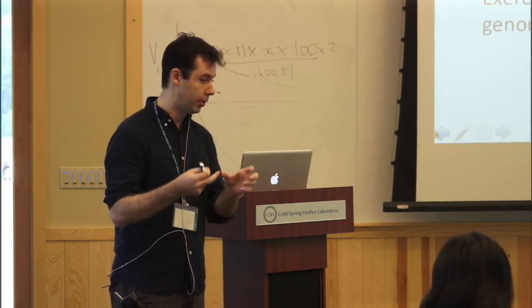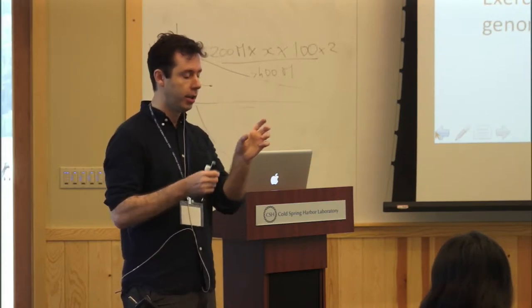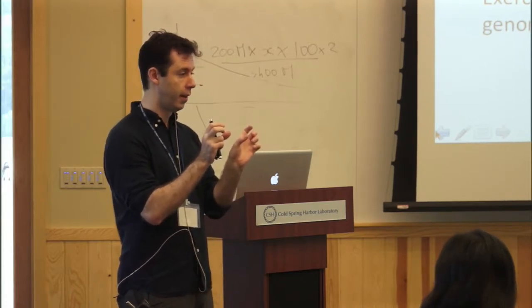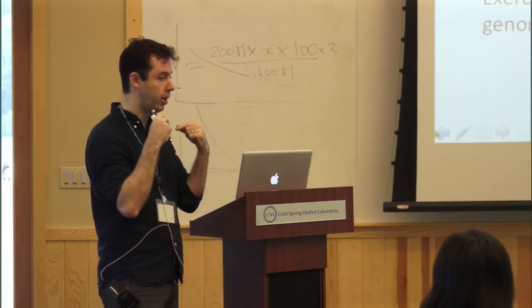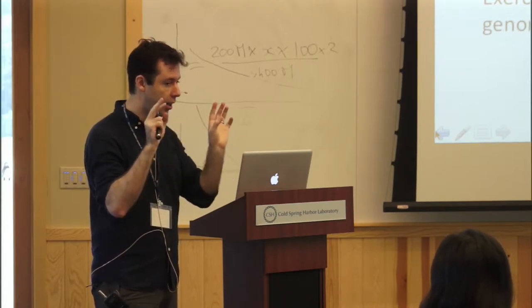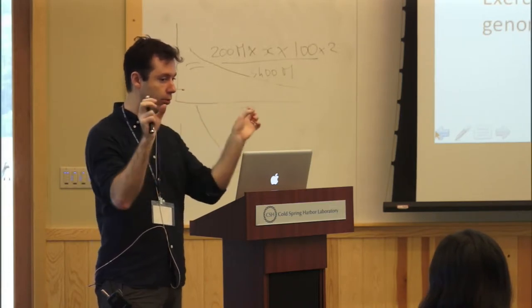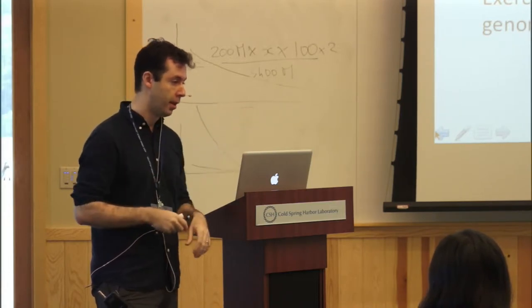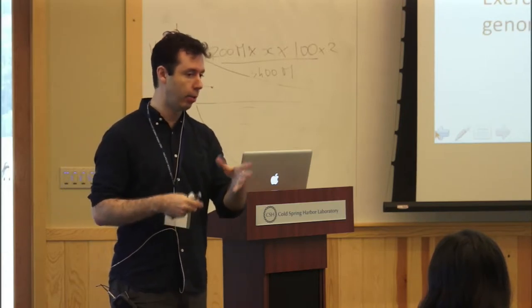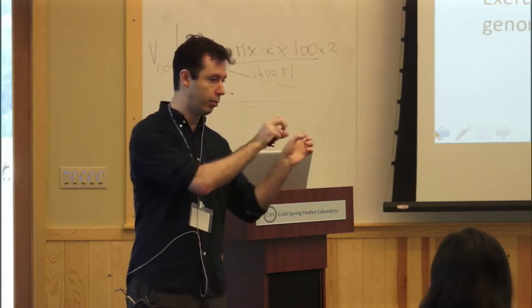depending on how you do the alignment, let's say you have a situation where your long read is actually spanning three very short exons. The software that does the alignment between your read and the mRNAs of a genome has to be smart about how to split this read into three different parts. For example, this is not a situation that would be well handled by Bowtie. Bowtie splits the reads into two parts. It's not splitting the reads into three or four parts.